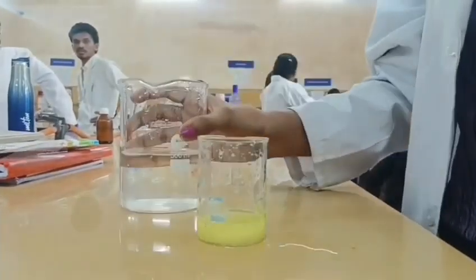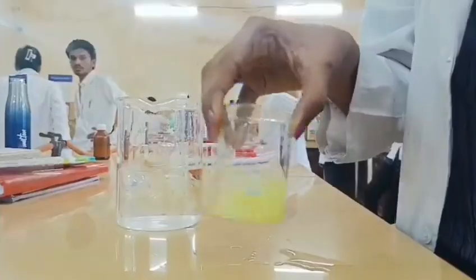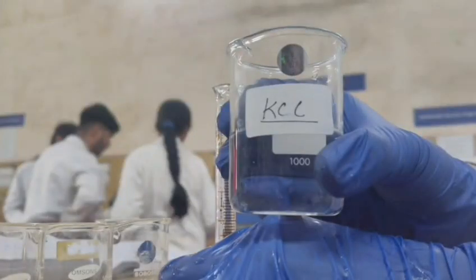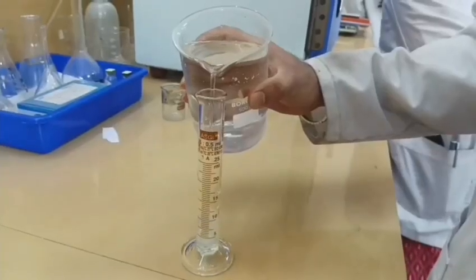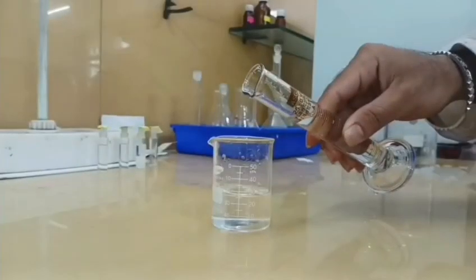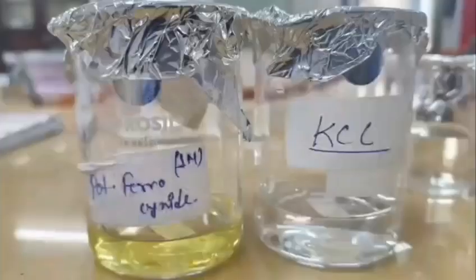For preparation we need to take 50 ml double distilled water for potassium ferrocyanide. Now after making up with this, our solutions are prepared.